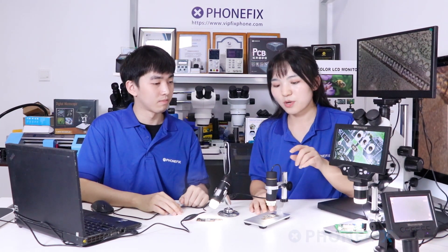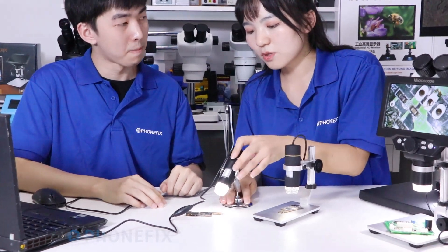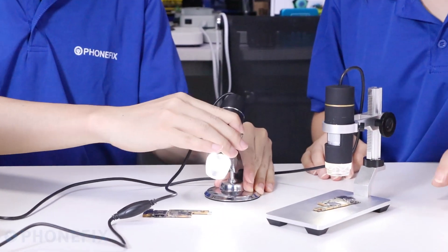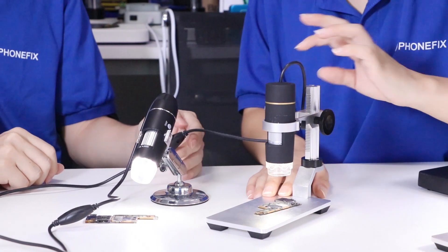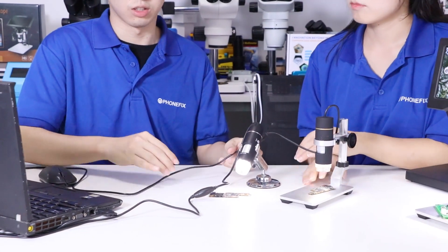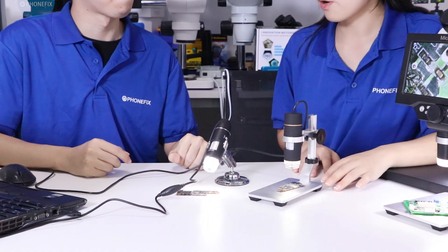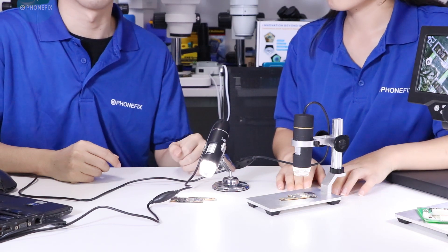Now we will show you two kinds of microscope. They are very portable and their magnification has reached 1000x. Like this one, it's mechanically rated at 1000x, and it has a very flexible design. It is disassembled easily, has 315 degree rotation, and it can adjust the height. Besides, it has a long cable that is light adjustable, and you can connect them to the computer via USB cable and use them with computer software such as Hirox and MicroCapture. They are practical — you can carry them for home or school, and use them for PCB inspection or student lab experiments.